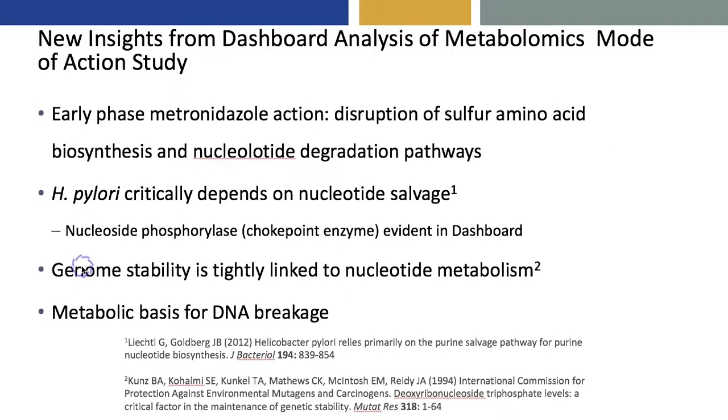And so there are several new insights that have arisen from this dashboard analysis of the metabolomics mode of action study for metronidazole. In the early phases of metronidazole action, we see disruption of sulfur amino acid biosynthesis and of nucleotide degradation pathways.